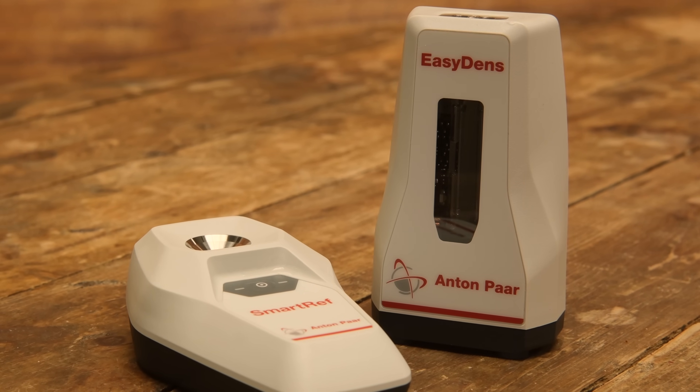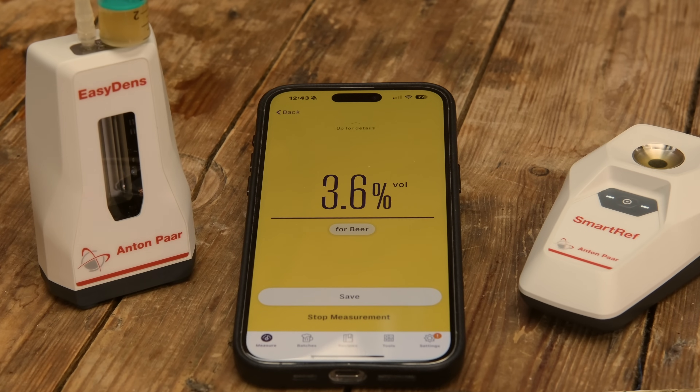What we're really excited about, Martin, is when you use both of them together, because you can actually pair both of these in the app and get some very specific and unique results by doing so. The really exciting thing is that when you pair these two devices together on the app, you can take joint readings and actually get the ABV of your beer. In the app you have the option to connect both devices. You take a sample of beer during fermentation or at the end of fermentation, put a sample through EasyDens and a sample into SmartRef, hit go, and it gives you both the gravity of the finished beer and the ABV to a lab-accurate level. And that means you don't have to have a recording of what the original gravity was to work it all out.